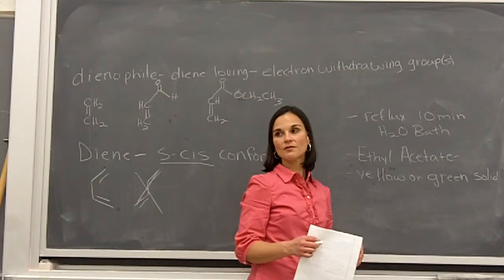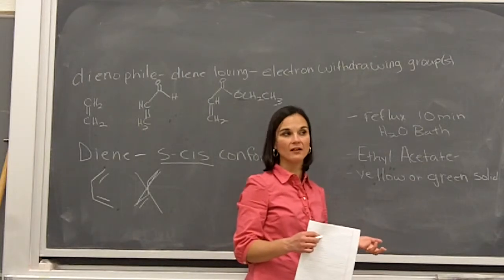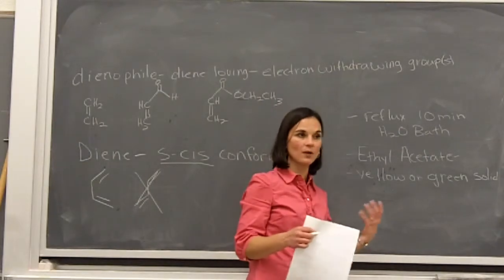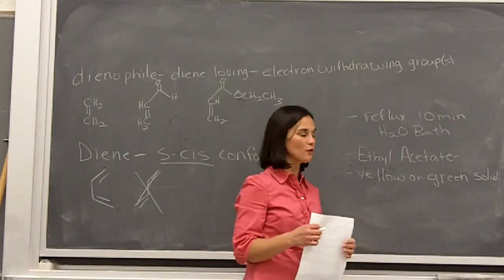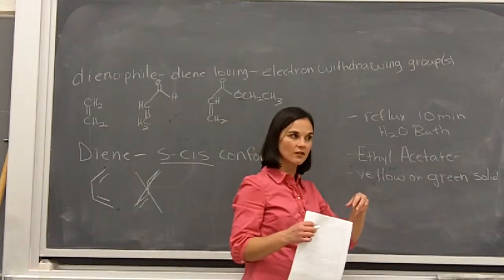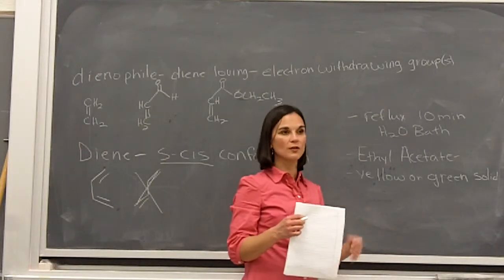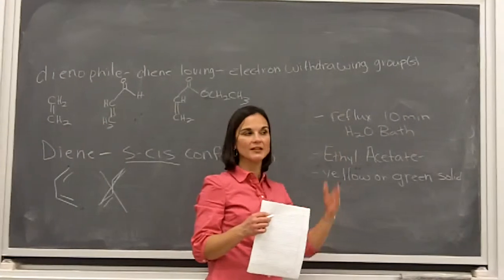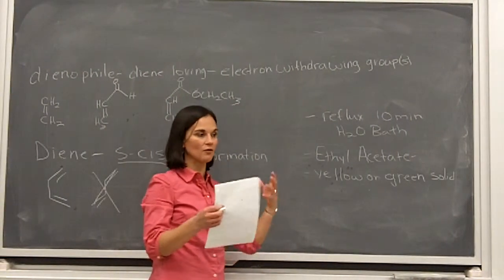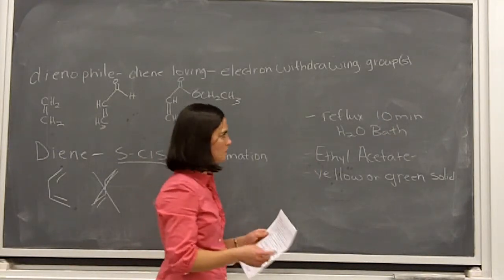Now, we don't have to go to the lengths that we did with Grignard. We're not going to be heating our glassware in the oven. But make sure you don't have any residual water or acetone in your glassware. Make sure it's dry before you use it. And even as you're stirring your solid in the ethyl acetate, make sure it's covered. Make sure you keep the reaction itself covered. During the reflux, of course, it's going to have an open condenser, but keep things as dry as possible and don't introduce any water, because then we may have trouble with the reaction as well.